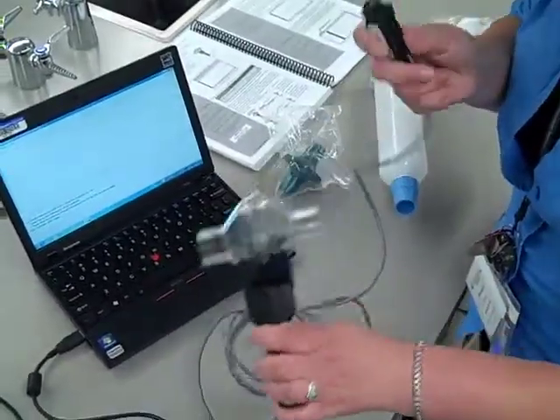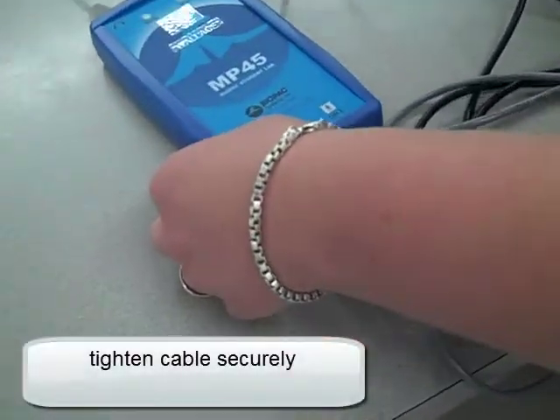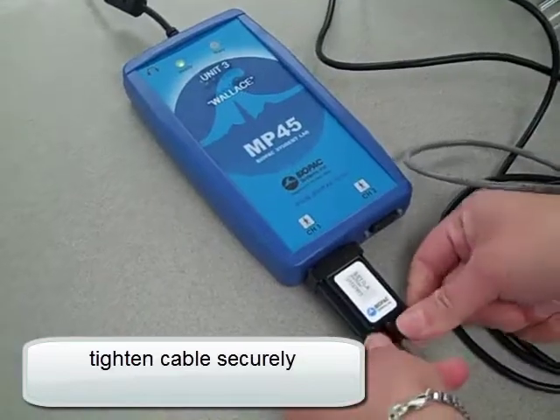So first, this is the airflow transducer. We're going to plug it into channel 1 here on the BioPac unit. Make sure it's tight.